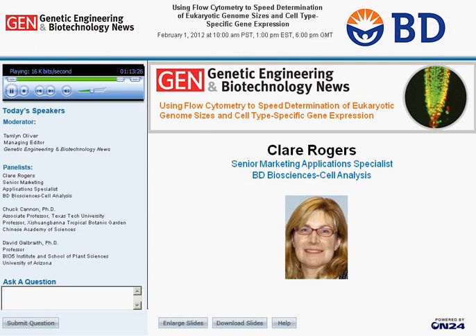But if there was a particular filter that we don't carry, we do have optional filters. I think they were listed on one of the presentation slides that showed the optic bench. You can see which filters are available. And if there is something specialty that you want, you would need to call Accuri and talk with tech support about the possibility of ordering one to be made.